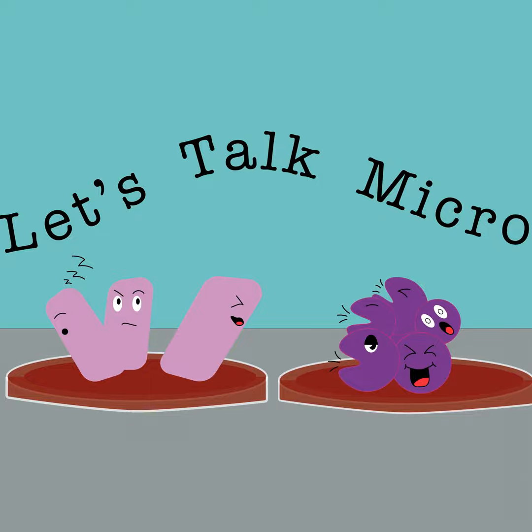There were a couple of times when students got oil on their 40X objective lenses, and they couldn't get them cleaned up properly. There was one time when we had to make arrangements to switch out a microscope, or we had to take it and clean it ourselves and give it back to them, but that was pretty rare. But there were sometimes technical difficulties that were a little bit more troublesome to take care of without being right there with the student. And we also had to anticipate everything that we could need ahead of time. That was challenging.